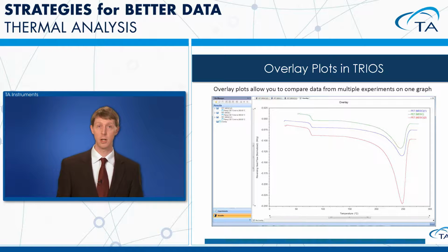So what you can see here is that on the left-hand side, we have our file manager. Again, the particular files that we want to be put into that overlay need to be open. But once you do that, you create a new overlay document. You can see that listed at the bottom of the list in the file manager. But then you have full functionality in terms of dragging data sets or segments or steps from your open files into your overlay. So you actually have a lot more flexibility in terms of creating the overlay.